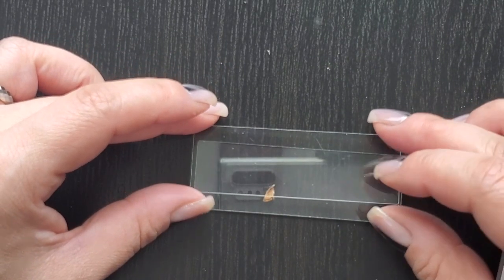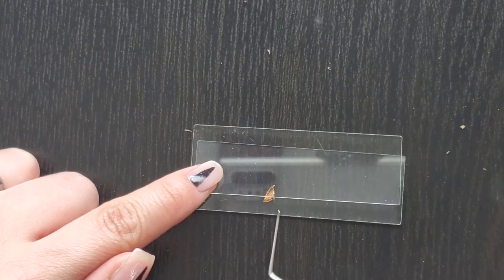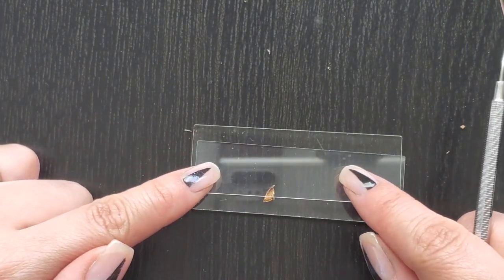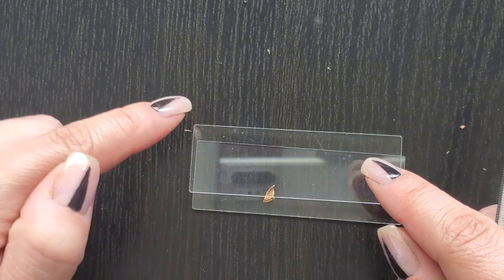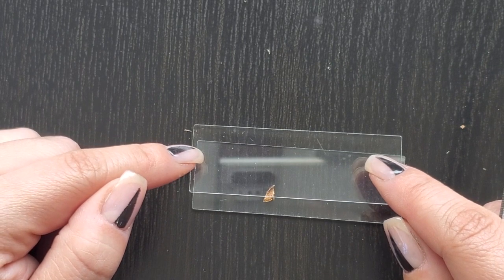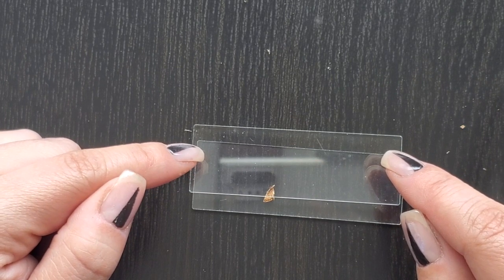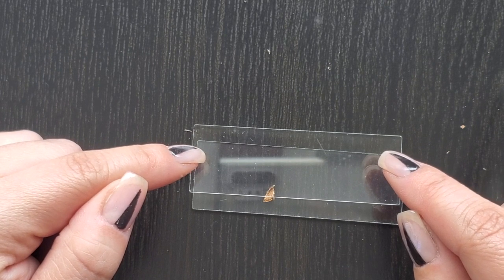However, you should press down first, and this actually may crush the really small gills because they're very dry and it's a small fruiting body. So I'll show you what happens when you don't rehydrate tissue. I'm not a fan of rehydrating tissue. My sections are never that thin on rehydrated tissue, which is pretty much, I think, the opposite of what books tell you. It just doesn't seem to work, and this is after 15 years trying to do the rehydrating method.